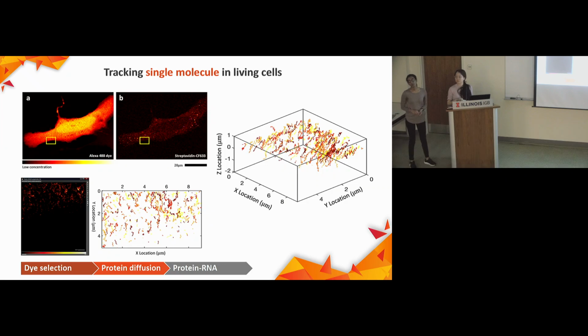So they record all the numbers of photons that you collect at each search point, and from looking at all of that information, you're getting a lot more information out than single molecule localization like PALM, for example, because there you're just getting the number of photons at a location.